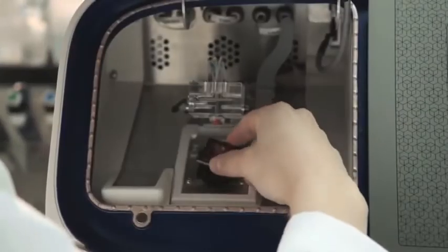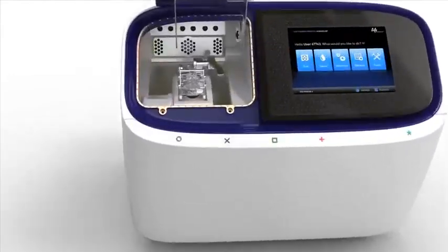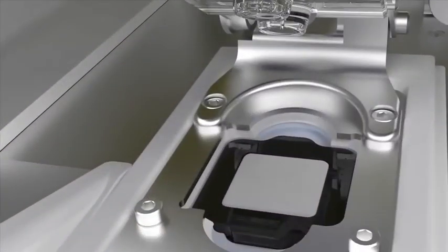The beautiful thing about what we're doing is that all the biology happens right on the chip. In essence, the chip is the machine. All the work happens right on the chip. And through that, we're able to actually do sequencing. And we're able to do it fast, we're able to do it cheap. The Proton2 will sequence a much larger genome, thousands of times more DNA, in a few hours. That's the power of semiconductor sequencing.